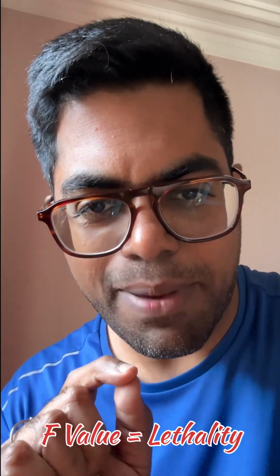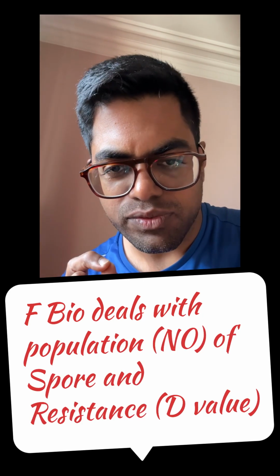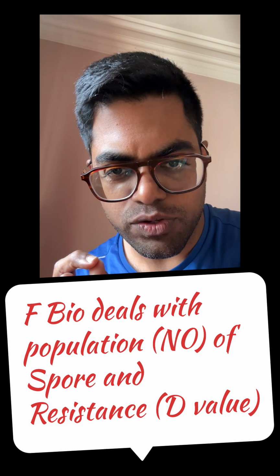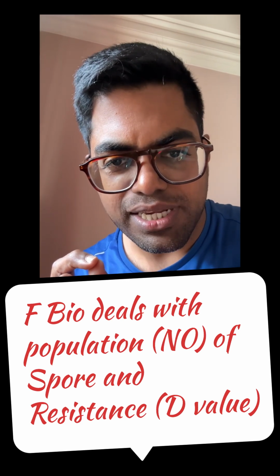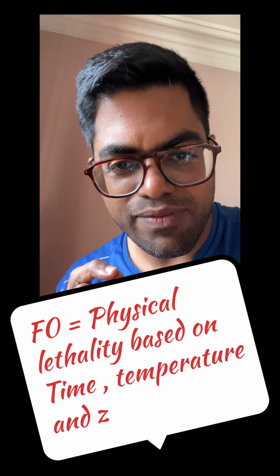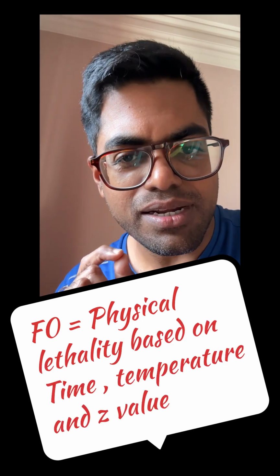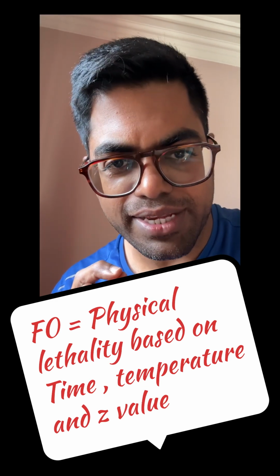Now it could be the biological lethality, the actual decay of microorganisms, which you are able to visualize when you place a BI, biological indicator, in your cycle. And F0 could be the physical value, which could be the prediction of the lethality. Just understand my word, prediction, right?